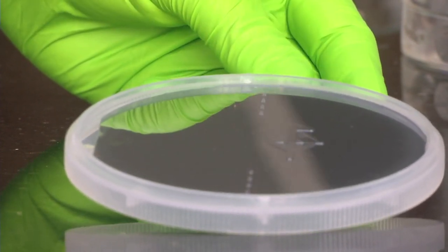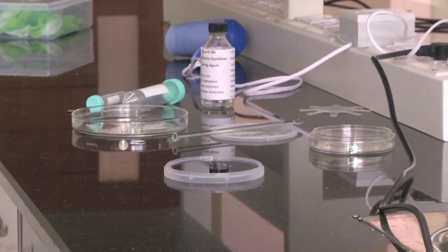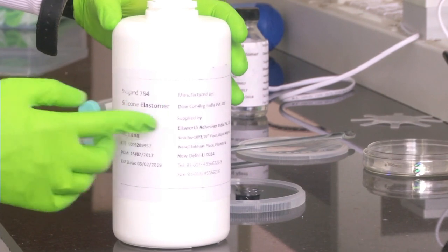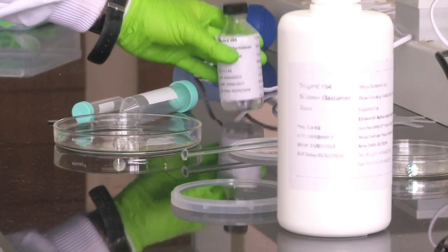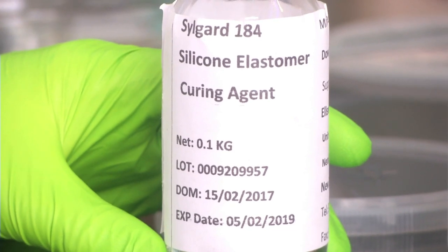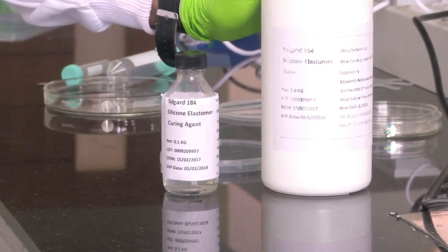Once the mould is ready we can do PDMS moulding. Today we will be doing PDMS moulding of this channel on the PDMS membrane. For this we have set up the experiment. We have silicon elastomer - that is what PDMS is generally called - in a 1 kg bottle, and we will use around 50 ml of it. Then we have the curing agent, which is what will make the PDMS become solid after sufficient time. We have to mix PDMS and curing agent in a 1-to-10 ratio: 1 part curing agent and 10 parts PDMS.